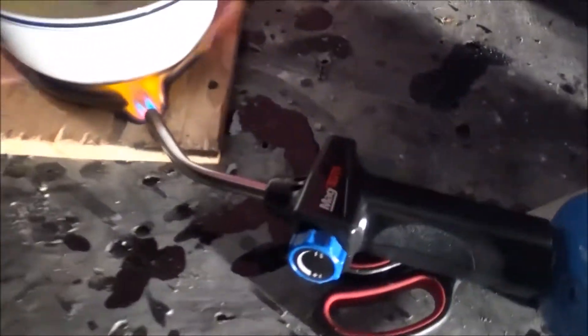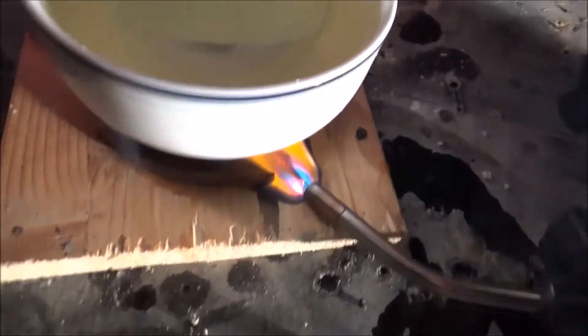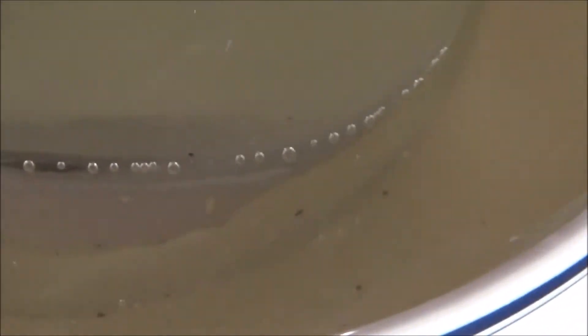So my strategy has changed slightly. Now I'm just using my blowtorch to heat the bottom of the jar directly, because it wasn't working before, and hopefully this will work better. Looks like there's some bubbles forming in the oil, which is a good sign.